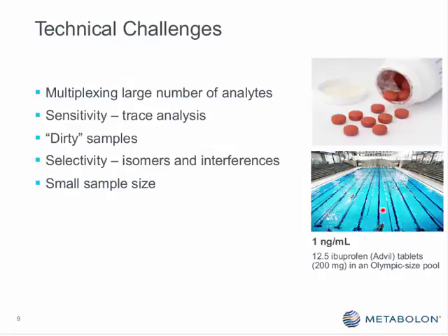On top of that, we're not looking at water. We're looking at plasma or feces or urine. So we really need to make sure these samples are cleaned up and injected on the instrument appropriately.